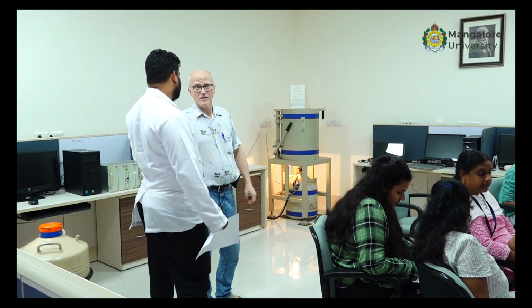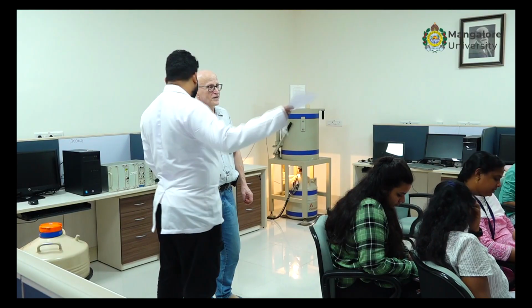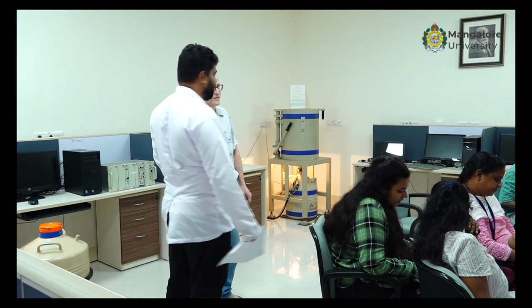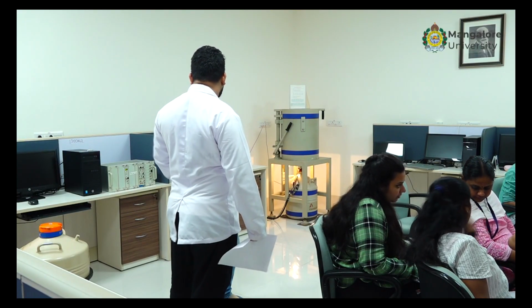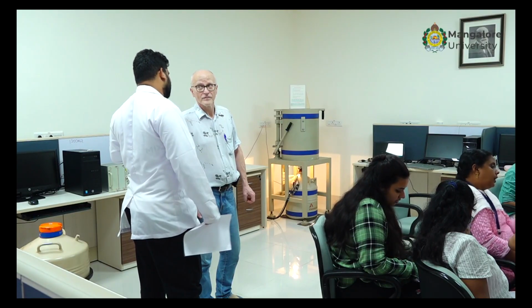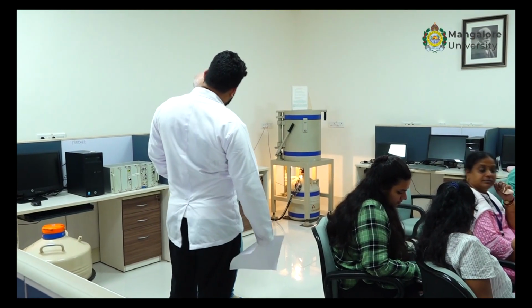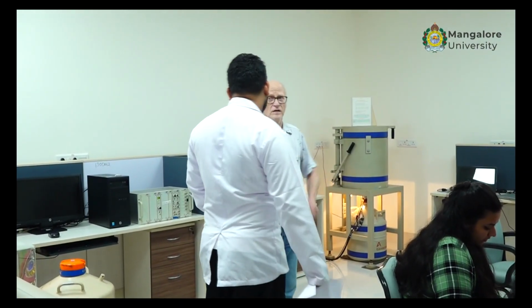If you do just the efficiency concept, you might not understand the nuances in the calculation. One batch is counting the gross, or this is the gross of the detector. They calculate the background, then they calculate the activity. How much are you using of a mixed radionuclide source.